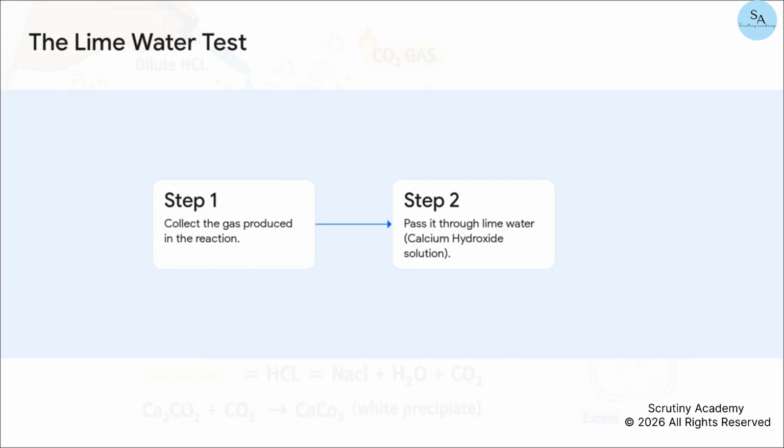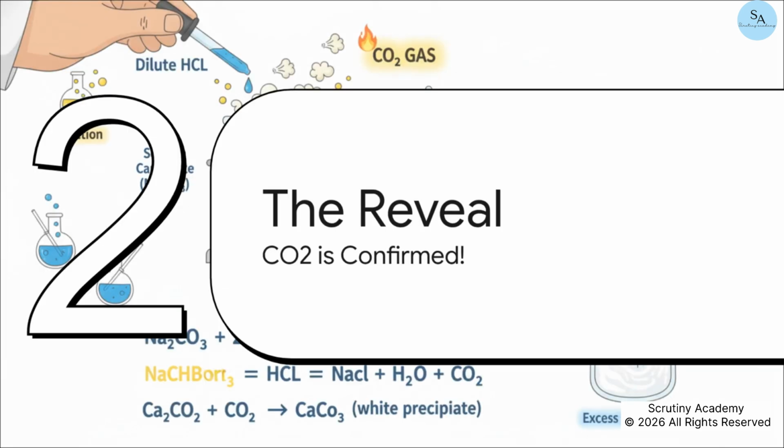Now, there is a very famous test for this called the Limewater test. It's simple. We just collect the gas that's coming out and bubble it through a clear solution called Limewater. Limewater is just calcium hydroxide solution. And now, for the big reveal, what happens to the Limewater is going to give us the final answer.